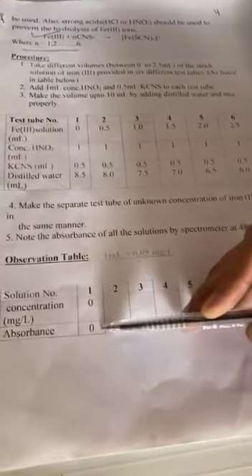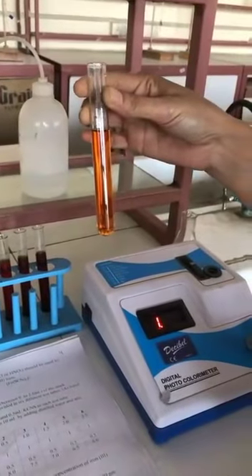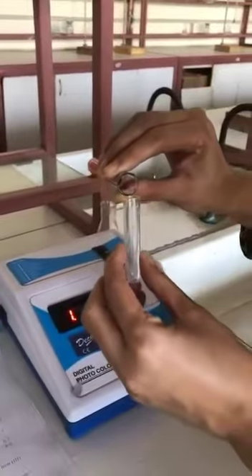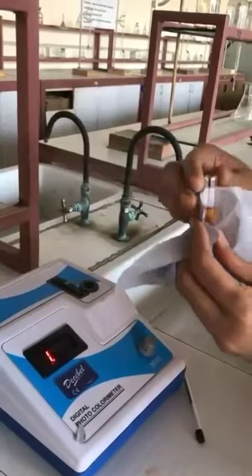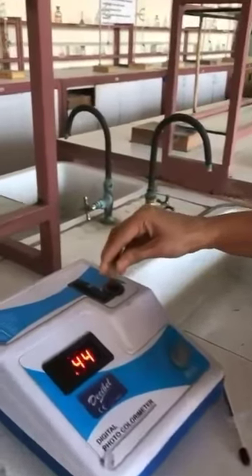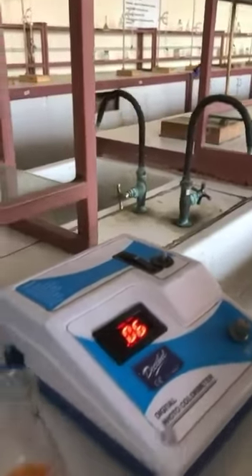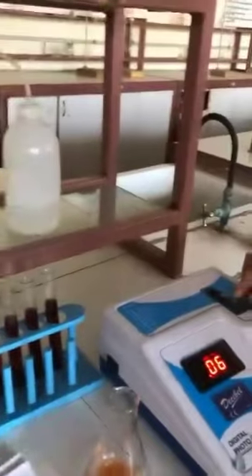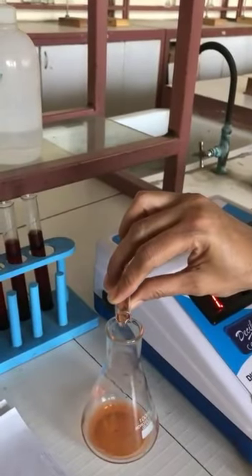So, for the first concentration 0, the absorbance value comes 0. Now, take the second test tube in which the iron concentration is 0.5 ml. In the same way, fill, dry with filter paper and insert in the colorimeter. Now, the reading reported is 0.06. Take out the cuvette and pour the solution into the conical flask.